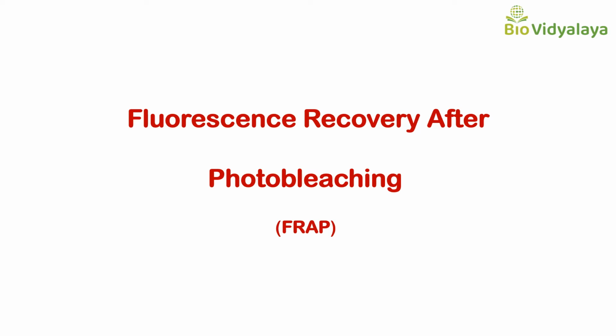Today in this lecture video we are going to discuss one cell biology technique, fluorescence recovery after photobleaching, FRAP. FRAP is a fluorescent microscopy technique, and based on this technique you will get both part B and part C questions in your CSIR NET examination.